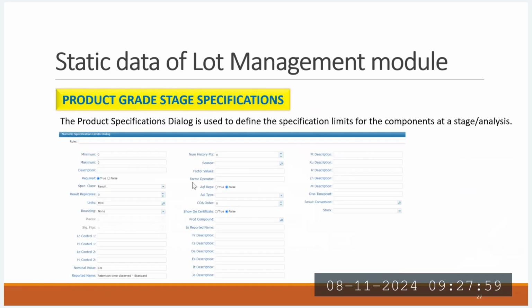In the same LIMS application, the way I have communicated earlier, once I prepare the product grade, then I have to update the specifications. How to update the specifications? If it is related to SA by HPLC test, how can I make specification limits? If it is part of any identification tests like description, IR, UV, how can I make the specification limits? All of those will be part of our product table discussion.